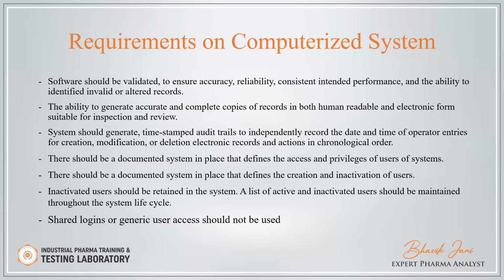Shared login or generic user access should not be used. Shared login or generic login means that if we create one login like QC analyst, then two, three, four, or five analysts will use the one login. It's a generic user or shared login. It's not allowed in industries.